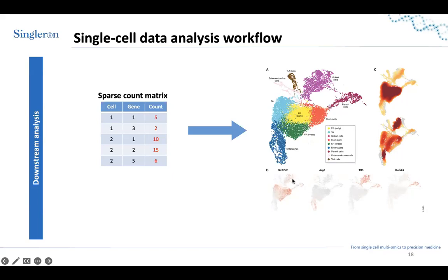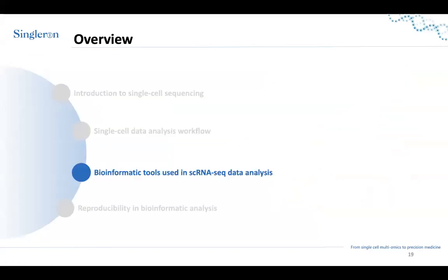And then when you also look in the gene expression file, you can see that the gene expression is not the same in different conditions. So this is the kind of analysis, the kind of result that we want to get. And we can even go beyond and do some enrichment analysis or even trajectory analysis, which again will be for the next webinars. So this was an overview of the single-cell technology and the main workflows in bioinformatics. Now, which tools are used in single-cell data analysis?